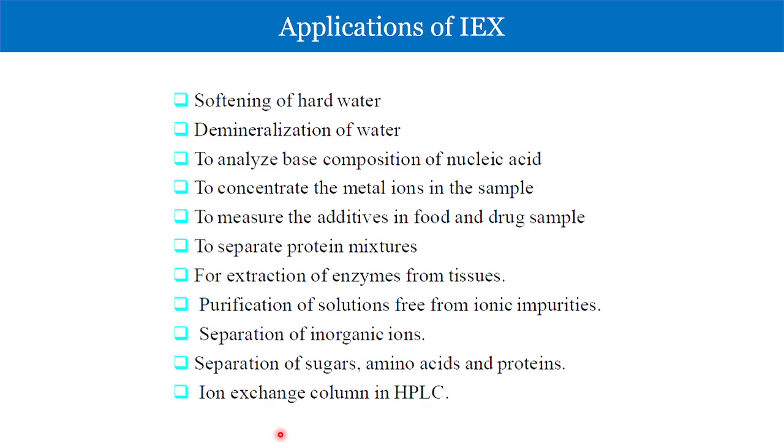So that's all from the theory point of view on the three. The major three types of chromatographies I have discussed are size exclusion, affinity, and ion exchange. Everything has its own advantages as well as disadvantages. So whenever you want to separate out a protein, it's not that there is a fixed manner in which you should carry out the chromatographic techniques such that you get a pure protein. It's not that you just know this chromatography and go about using it, okay?